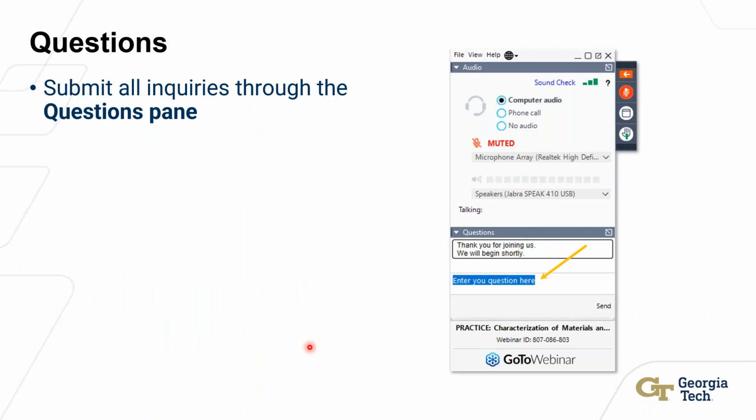For the 4D STEM data sets presented here, was the camera a direct detection camera, a hybrid pixel detector? Was it scintillator based? So it's a direct detector. All of them that I showed here were direct detector using a Metro 300. So there's no scintillation.